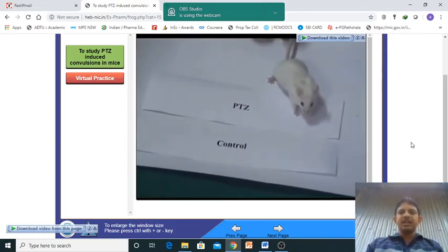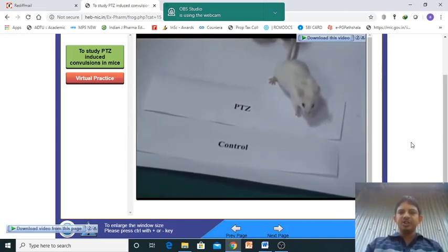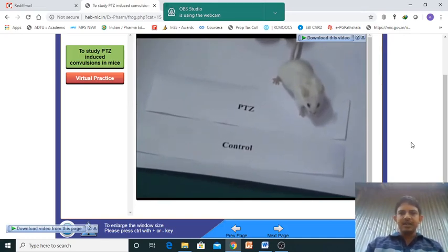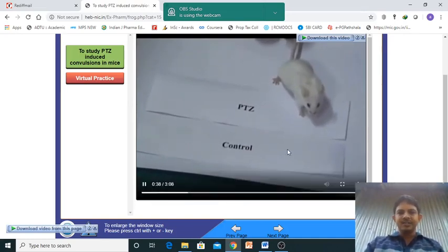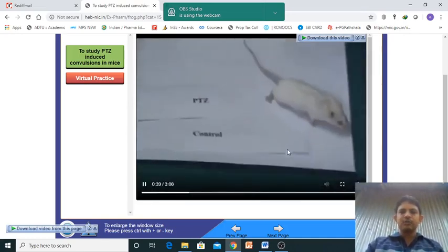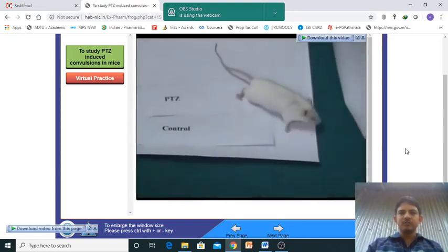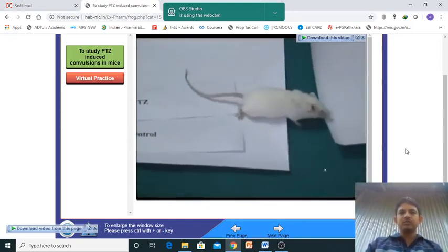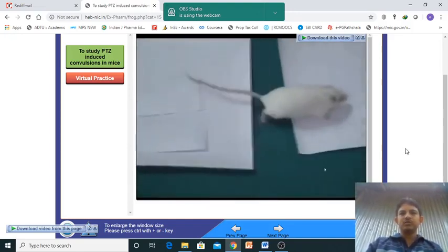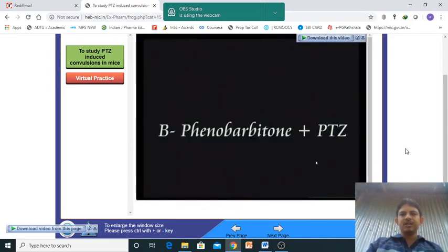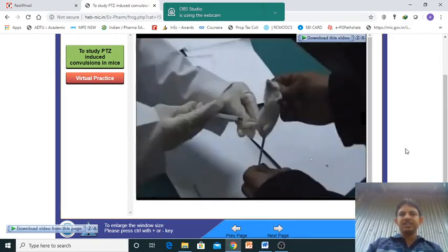We will observe what happens after administration of PTZ and also look at the other group in the video. You can observe the changes clearly.